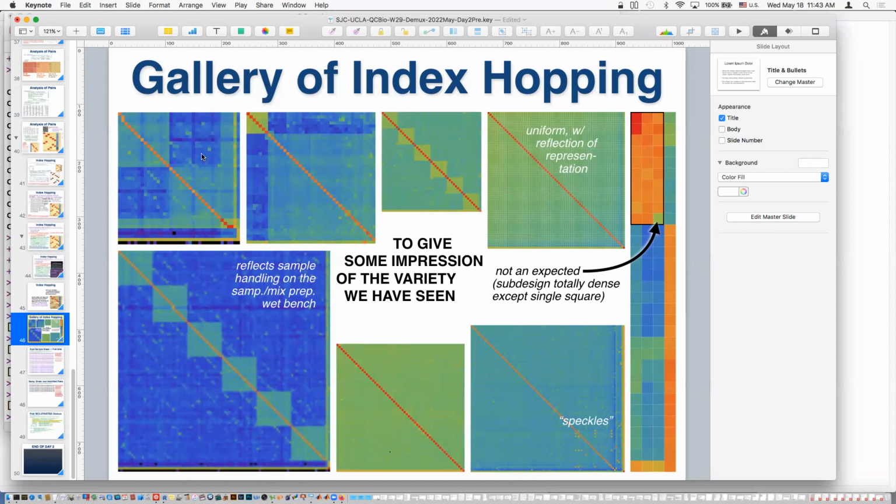Where certain pairs of sequences are sequence-wise close and will cause an I1 or an I2 corruption in such a way that you land in another guy's file, but the other half, I2 or whatever, hasn't gone there. So now you see it in this view, and it's in the wrong pair file, and looks like an index. And effectively it isn't an index, but it's a different method.